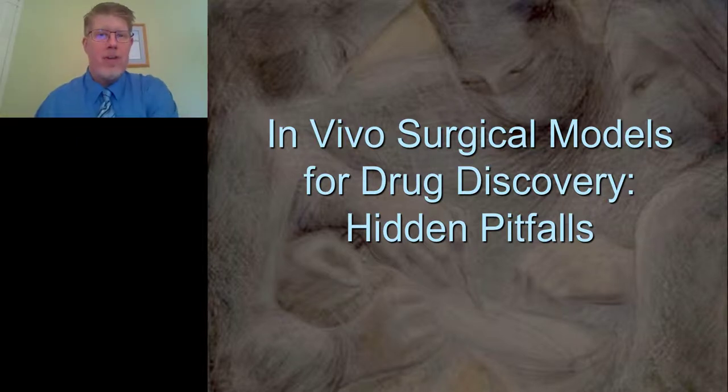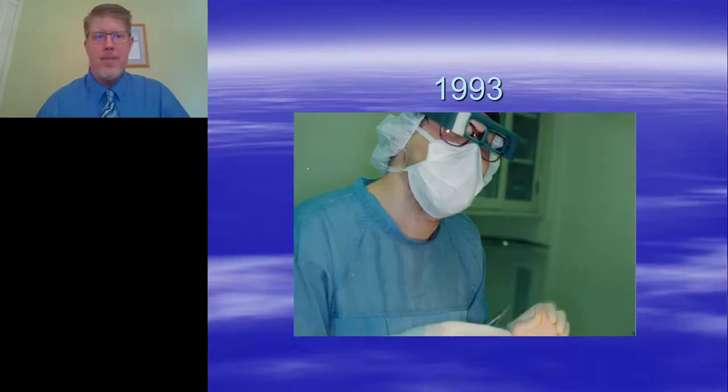Hello, very nice to virtually meet all of you. Today I am going to be covering several things related to how to properly use in vivo surgical models for drug discovery. As the title suggests, there are plenty of traps and pitfalls to step into, so I'm going to try and give you a jumping-around overview of things that would be very useful for you to keep in mind when you're planning these types of studies.